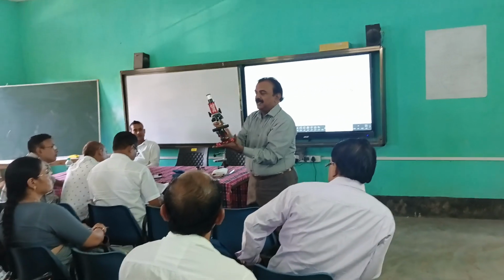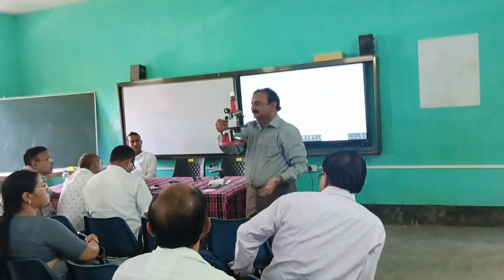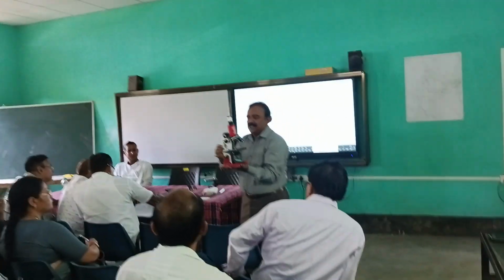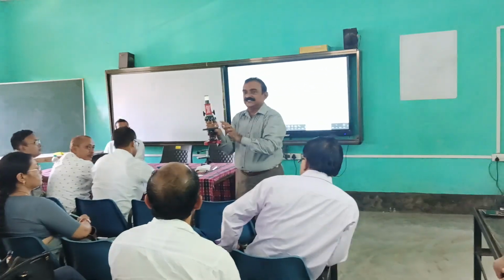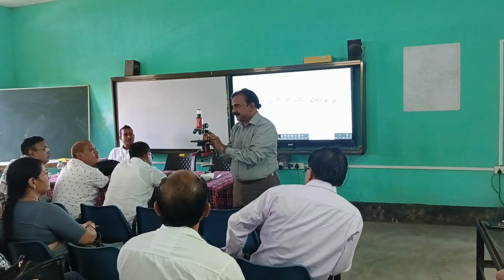Now you are seeing this one. What is this one? Handle. I hold the compound microscope here, and this part is called the handle. And there is a platform. This is called the stage. And these two are called stage clips.